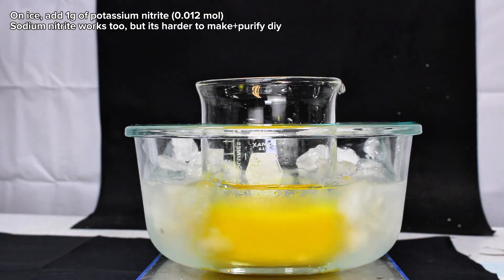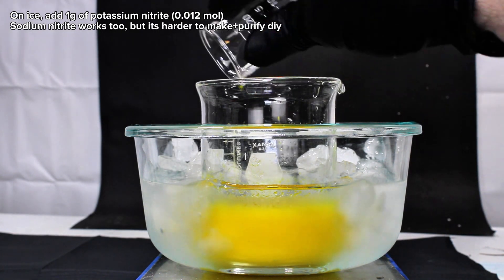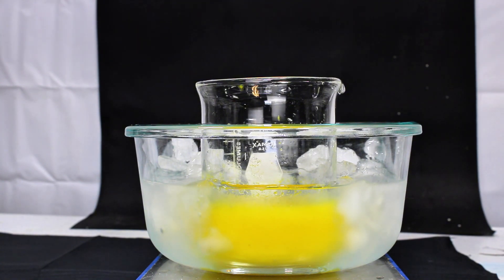This beaker was next transferred to an ice bath, and to it I added 1 gram of potassium nitrite dissolved in about 3 milliliters of water under constant stirring. This is allowed to continue reacting for about 15 minutes, and during that time the solution might lighten up a little bit as the reaction proceeds.